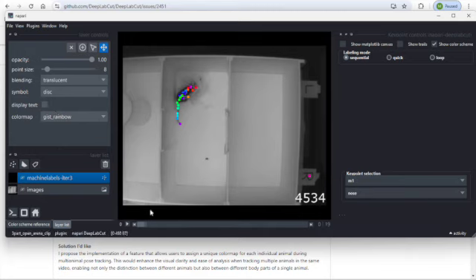So what you're going to do from here is start editing the labels that DeepLabCut has put on. So first, if you hover over a point, you can see in this bottom toolbar, it is telling you the label for this is pup, or even right next to the mouse, it eventually can pop up.